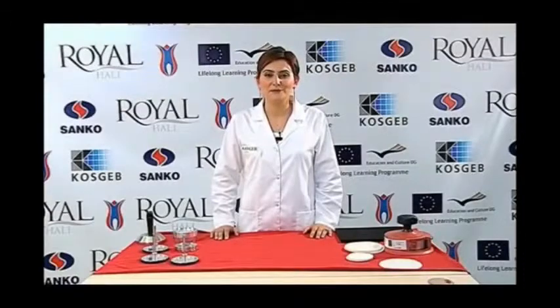Hello friends! The determination of fluffing and pilling tendency in fabrics with the Martindale method. This is an evaluation of fluffing and pilling on the textile fabric surface as a result of friction. Pilling occurs when the ends of fibers blend into each other to form pellets as a result of friction.